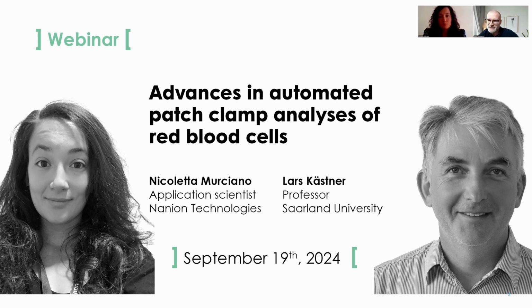Michael Netzer. So the first question will be to Nicoletta. Thank you for the great presentation, Nicoletta. I have several questions. Why did you not see a TRAM34 response in RBCs on slide 7?